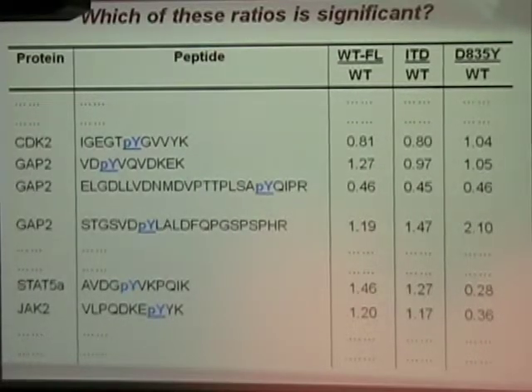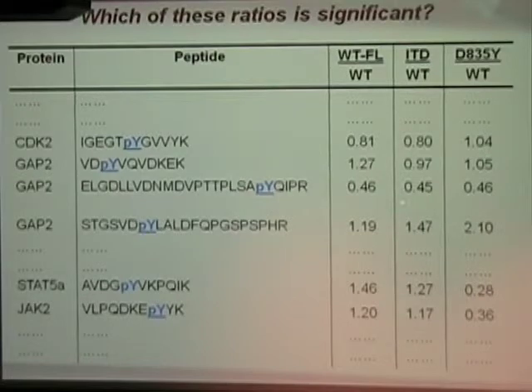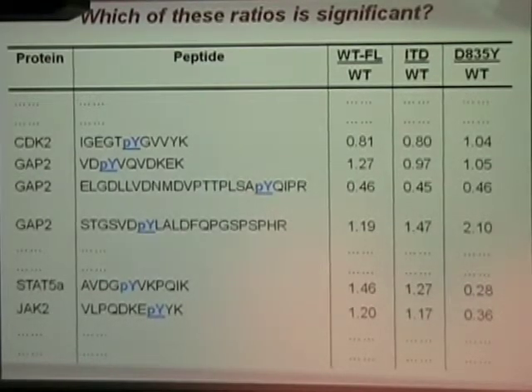we're going to be looking at a few algorithms and tools. The first challenge is a quantitative challenge where we're trying to get a sense of which of these ratios, now we're comparing these 3 conditions to the wild type, are statistically significant. You've seen a lot of talks in the microarray realm, in the large next generation sequencing, where people are asking similar questions. When you're doing your typical proteomics, and you have multiple peptides that are assumed to be coming from the same protein, and you just care about protein amount, you can have some redundancy in some statistics because you're looking at multiple peptides.